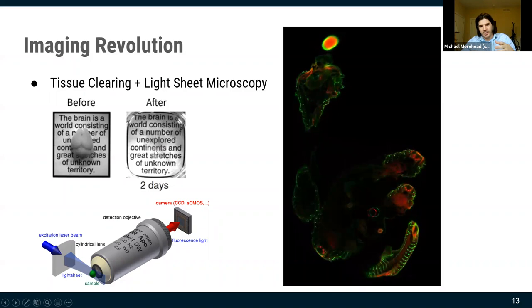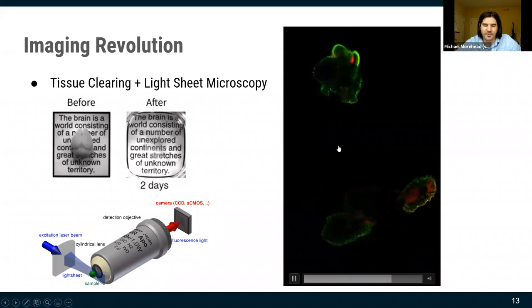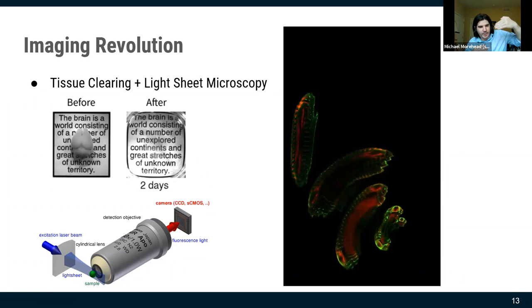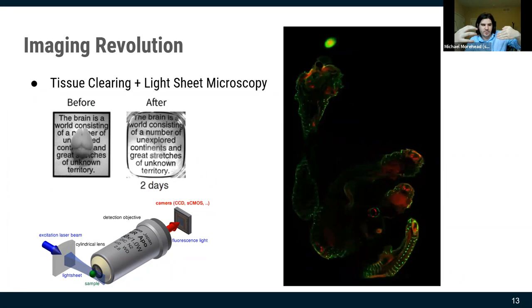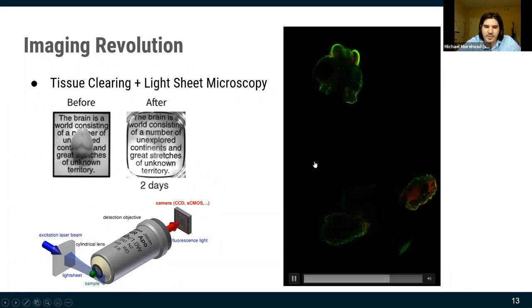Once tissue is optically transparent, you pass your sheet of light through it, capture images with a camera, and build up a stack — this is a snake embryo, you can see it spiral up. You can create multi-hundred gigabyte image stacks of incredible detail. Tissue clearing also enables expansion microscopy, where the sample swells in size, helping you get around light's diffraction limit without going to EM resolution.